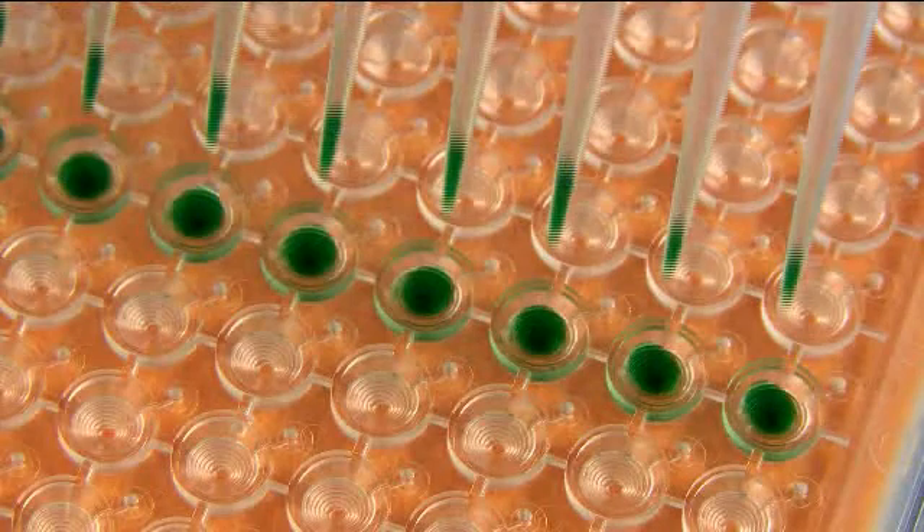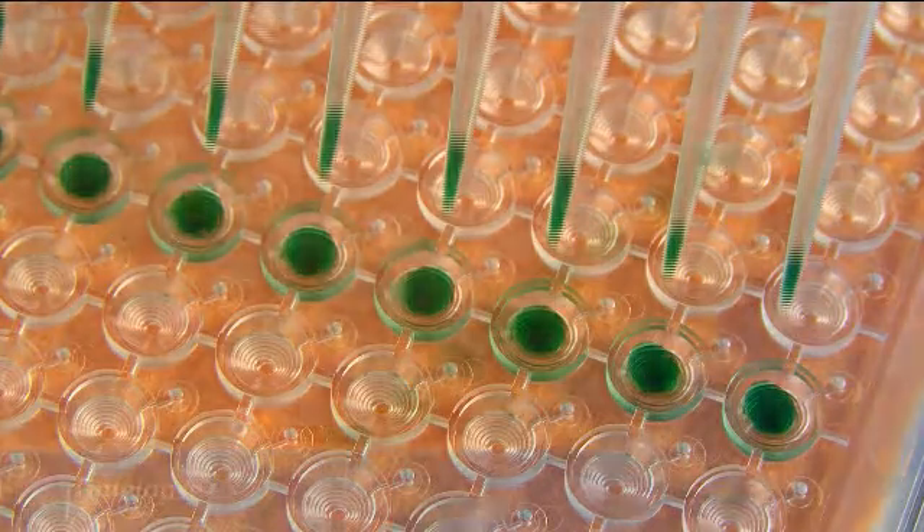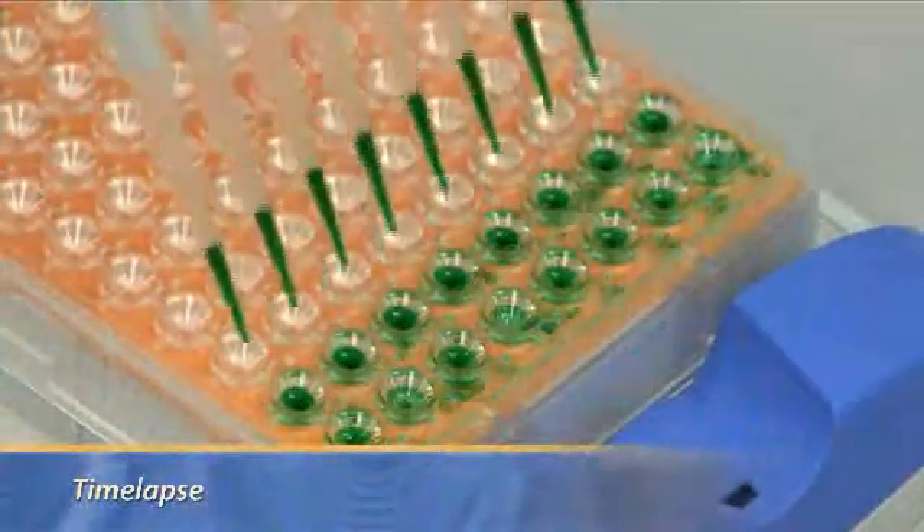When you dispense correctly, you will see some residue in the pipette tips, which is exactly according to recommended pipetting guidelines. As you can see, it is easy and quick.